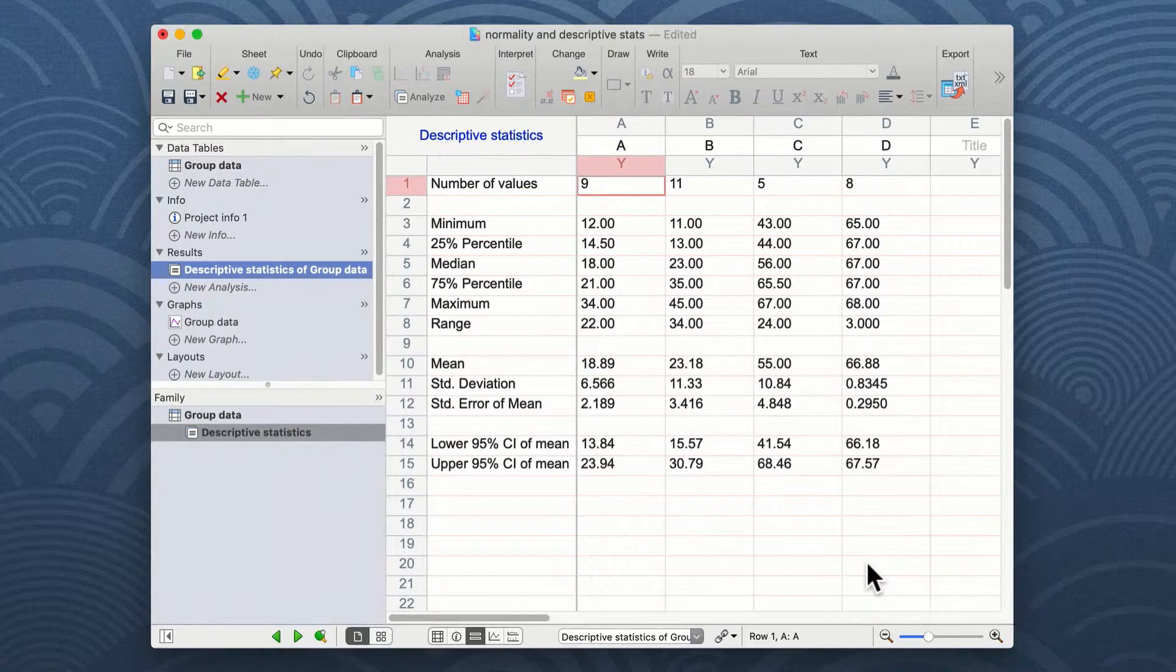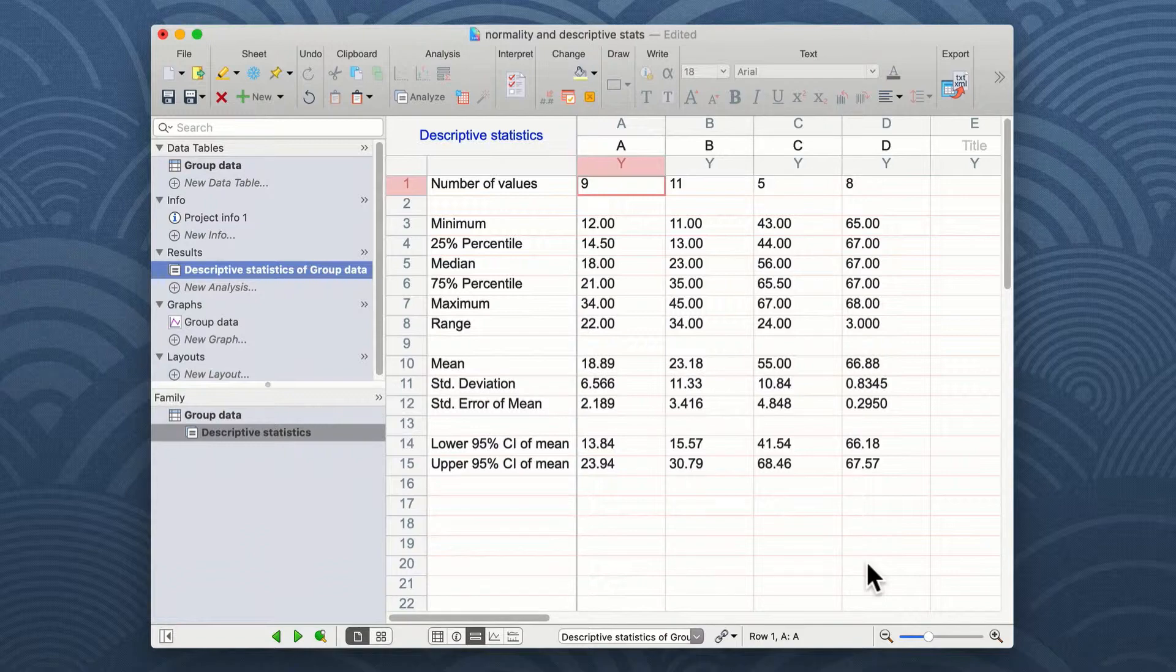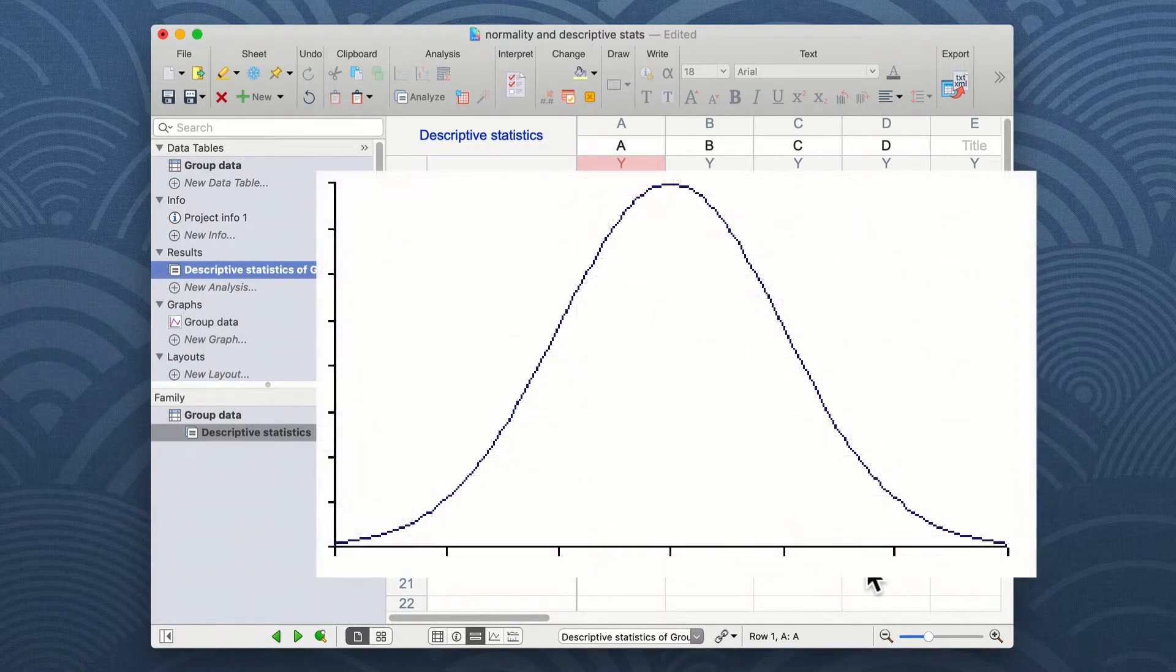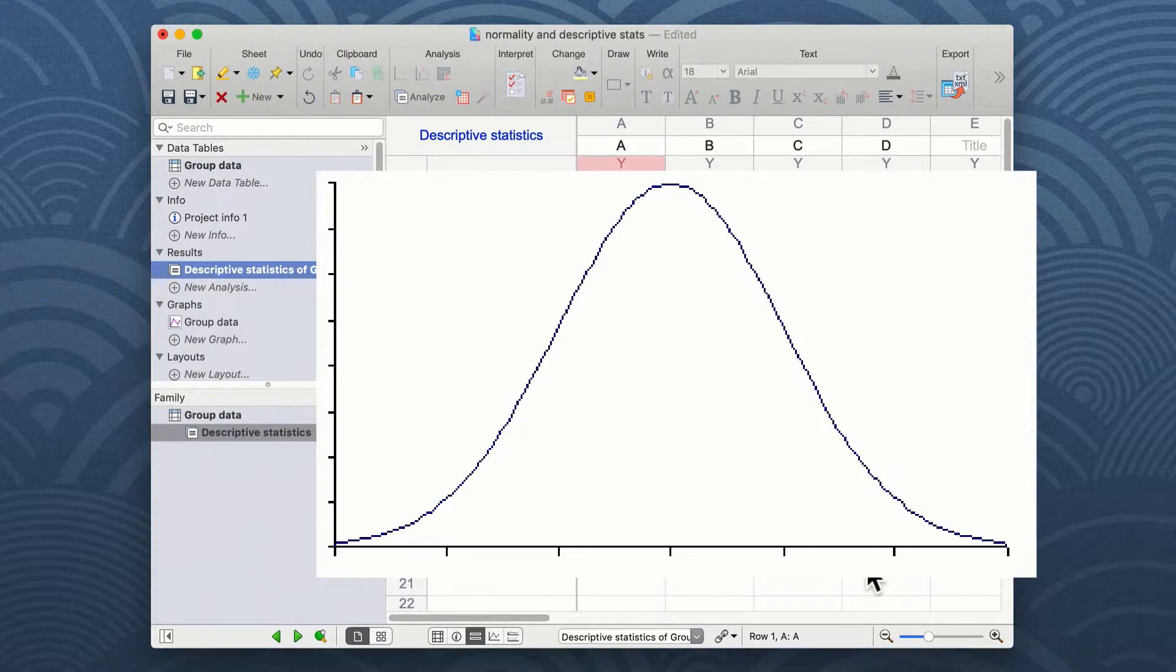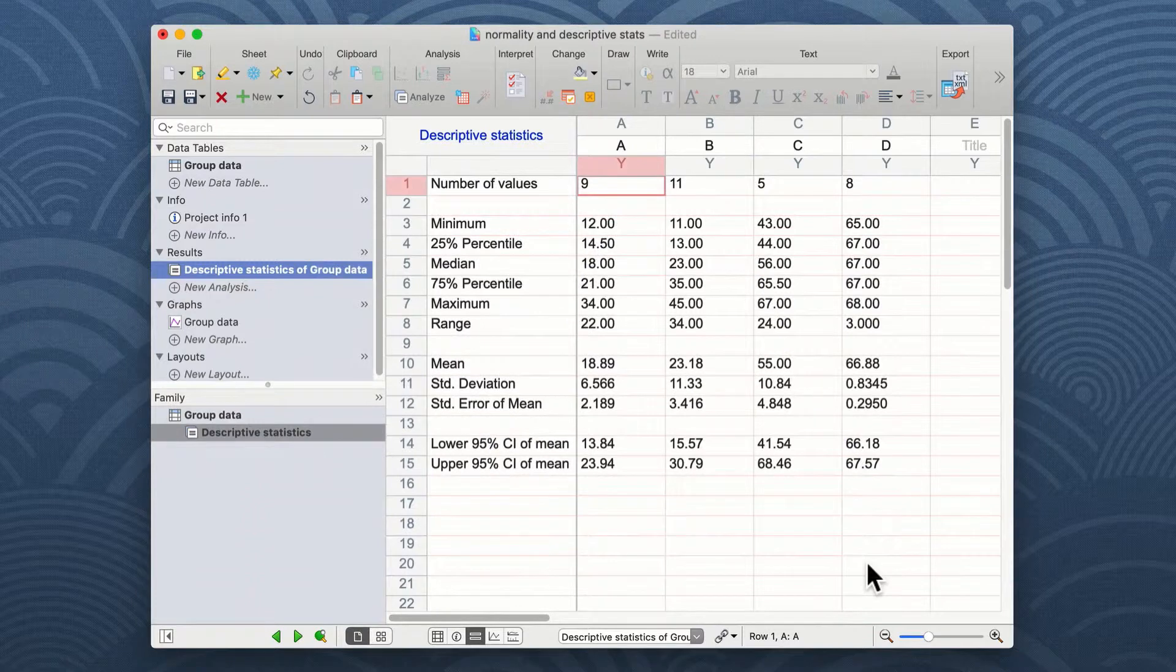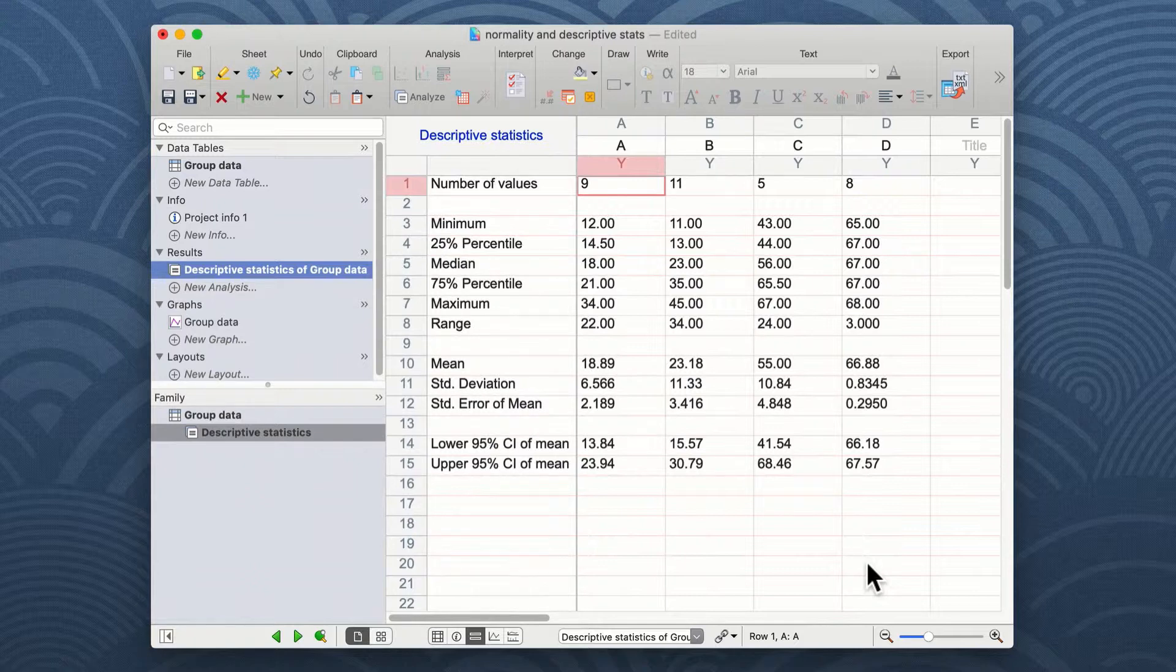Now that we know a little bit about our data in terms of the mean values and distribution around those means, it's good to know whether our data fit to a normal or bell-shaped distribution curve. When carrying out a parametric analysis of your data, such as a t-test or an ANOVA, it's important to know whether your data are indeed normally distributed before you do these tests.